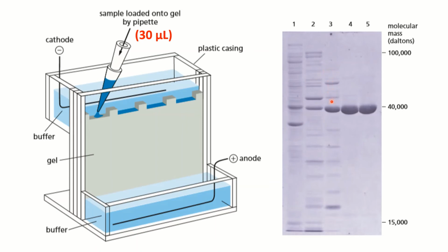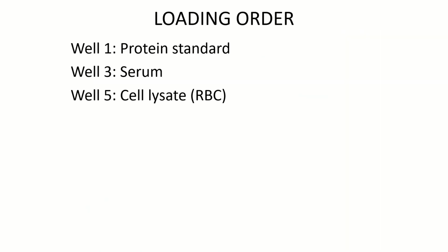So different proteins traveling at different rates. We can also graph this against the mass or the size of the protein. So we can see here the heaviest of the proteins are just somewhere here on top, while the lightest of the proteins have traveled really the farthest along the gel.